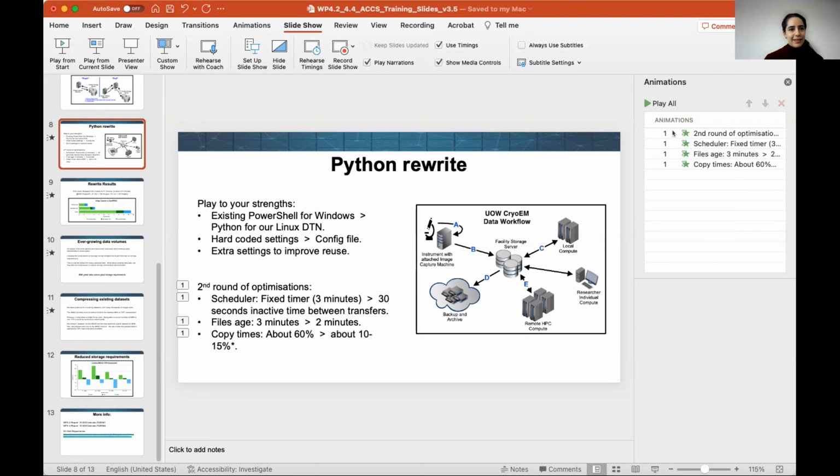Yes, Kieran. Hi, I just wanted to ask, when you're doing the MRC to TIFF conversion, was that a slightly lossy process? I know you saved 5 times the amount of data, but was it slightly lossy during that time? No, that was all lossless. Okay, I just wanted to clarify, cool, thanks. So that was definitely lossless.